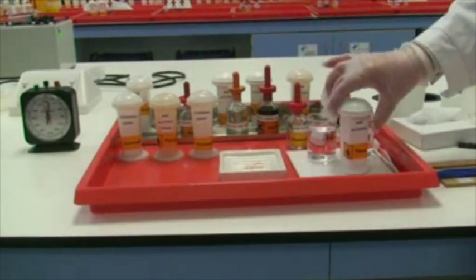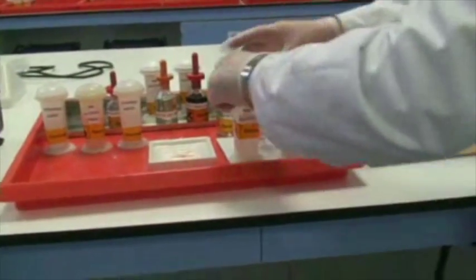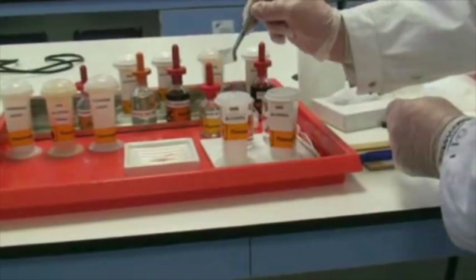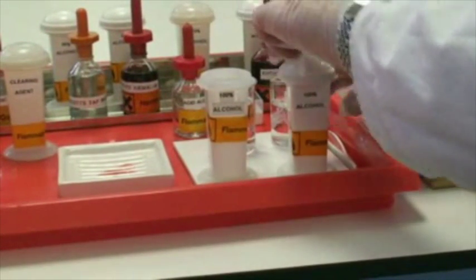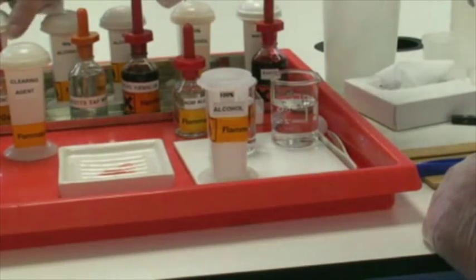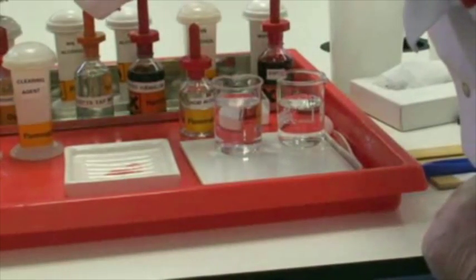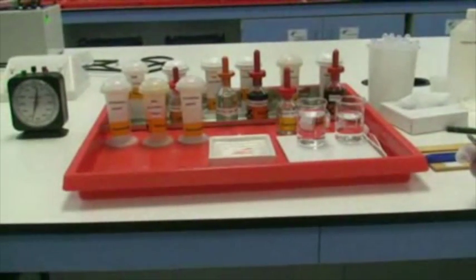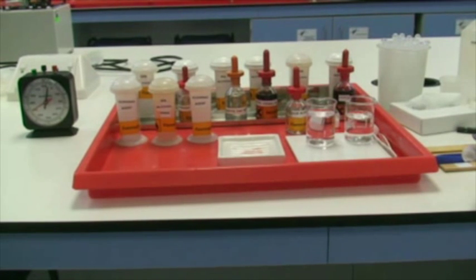We can now transfer over to the second and final solution of absolute alcohol — take both lids off and transfer across now. We then have a final two minutes before we move into the final solution, which is our clearing agent. Remember, the clearing agent is there to remove any remaining water and alcohol present in the section, so that we can then get to the final step: mounting the section in the resinous mounting medium.